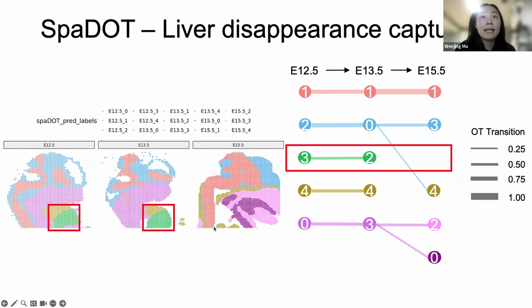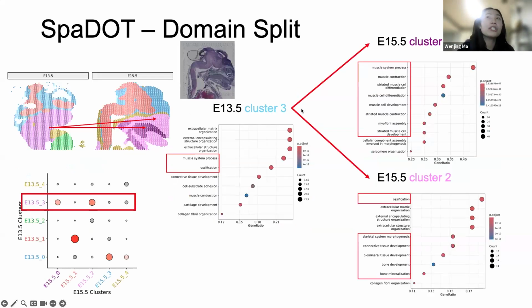Here we get certain regions that aggregate with the heart region, and we also denote a split in the mesenchymal region. But later on, we justify that these are all detected, like these regions for the tongue and muscle regions, they are all detected by all the methods. And also from the stained image, you can clearly see this here.